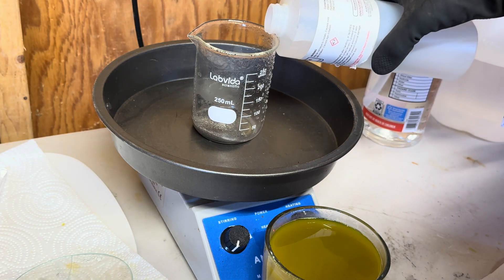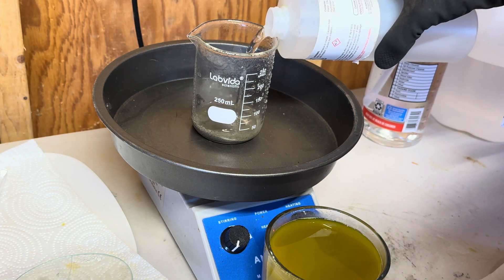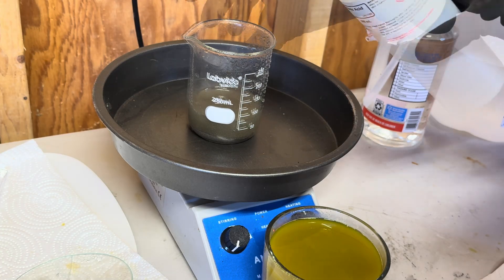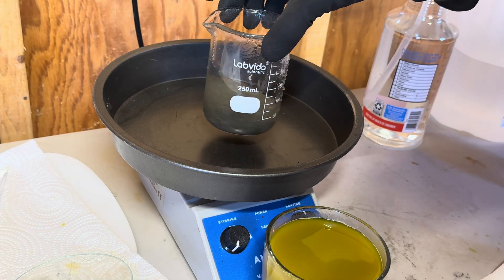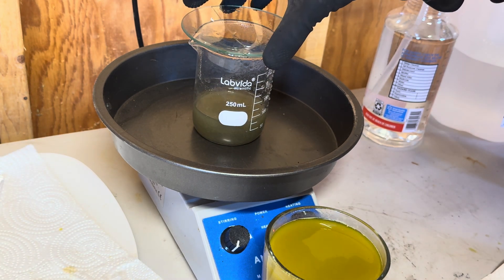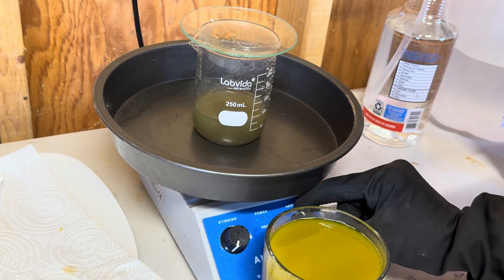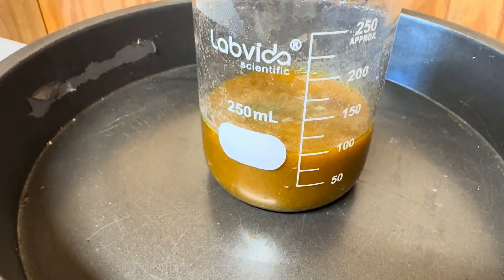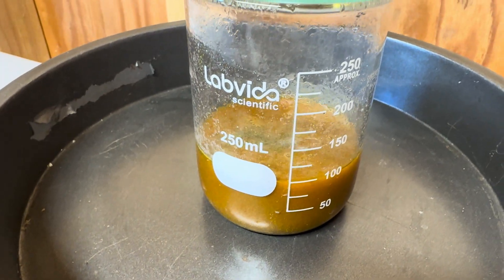We are performing our second wash and I am adding in 100 milliliters of hydrochloric acid. We did bring it to a boil and let it boil for 45 minutes.